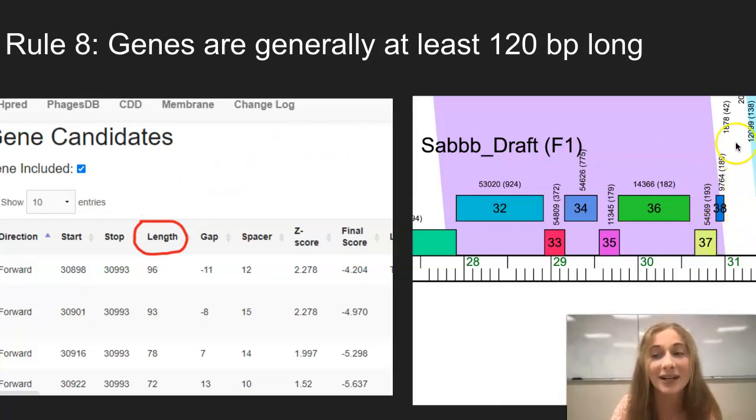But if we look at pecan, we can actually see that it is very normal for this abnormal short length to exist because 189 other phages within this fam also call this short gene. But if this number were to be smaller like 1 or 2, then we should probably consider deleting this gene.